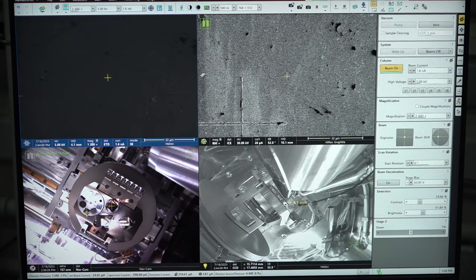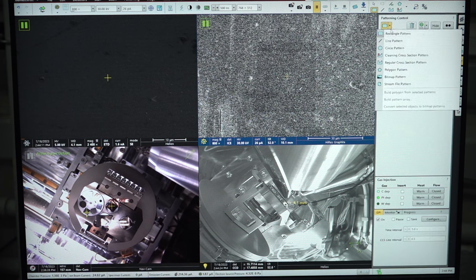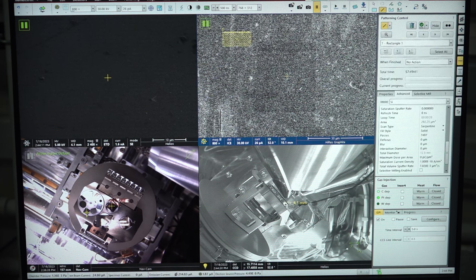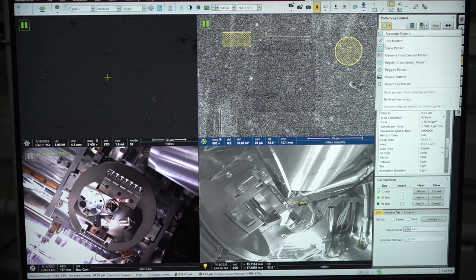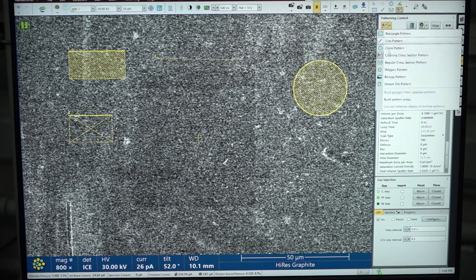Let us say this is my region of interest where I would like to perform milling operations. The same image can be seen in the ion beam — this is the ion image. Now we will perform milling operations and move to the patterning page. These are different patterns available: rectangle pattern, line, circular patterns, cleaning cross section, regular cross section, and polygon — it can be of any shape.